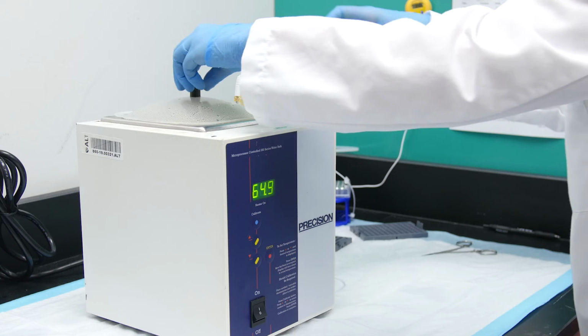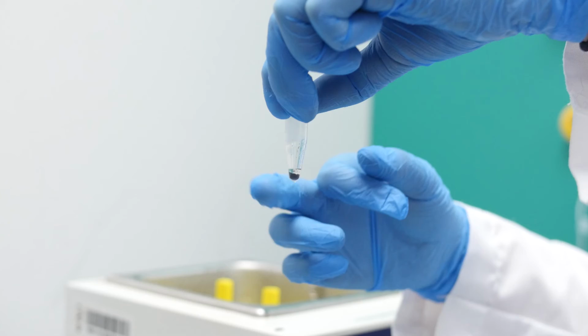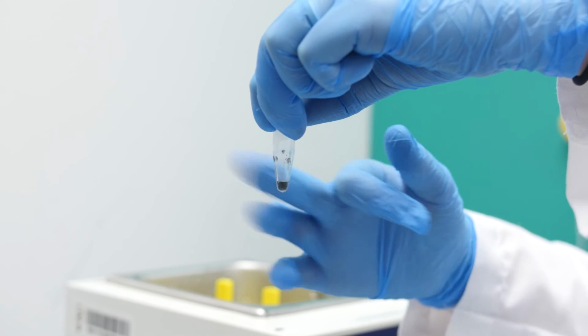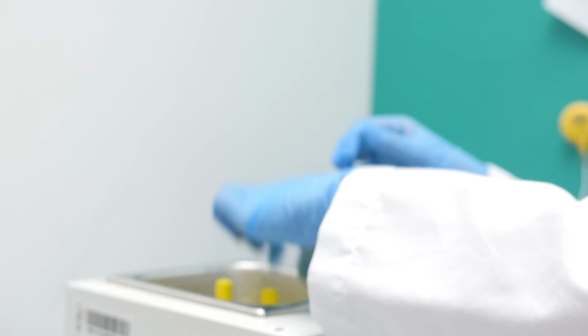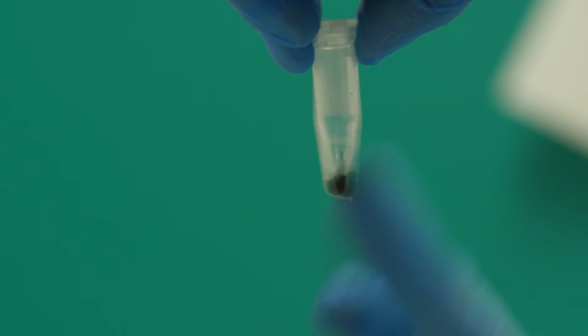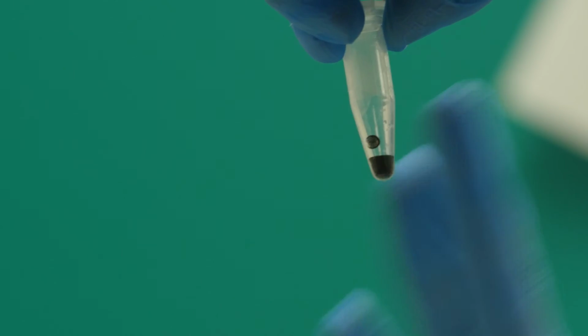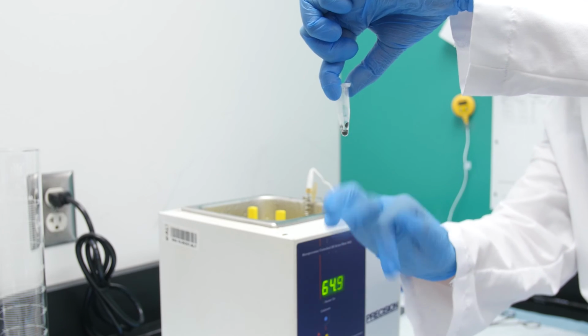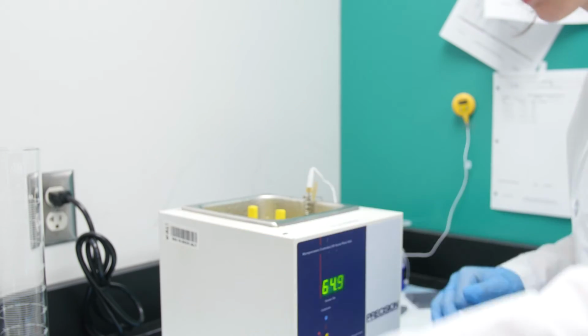Then place the sample in a 65°C water bath to encourage RNA release. Mix the sample by flicking it once every minute or so. RNA can also be released by mechanically mixing the sample, but mixing must be very vigorous for 3 to 5 minutes, and this method is only recommended if a robot or automated instrument is performing the extraction. For a human, a bit of heat and gentle mixing once or twice is typically easiest.